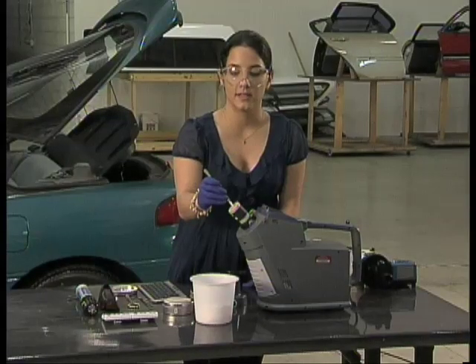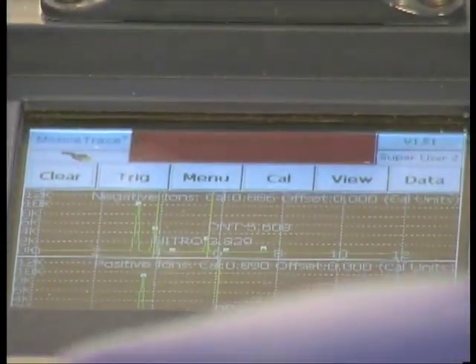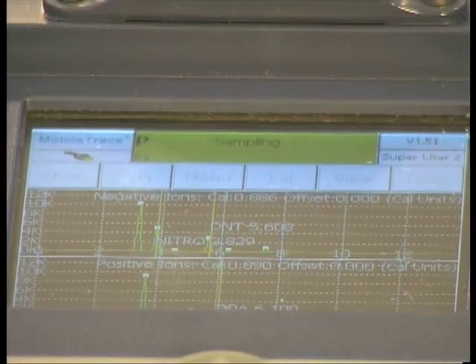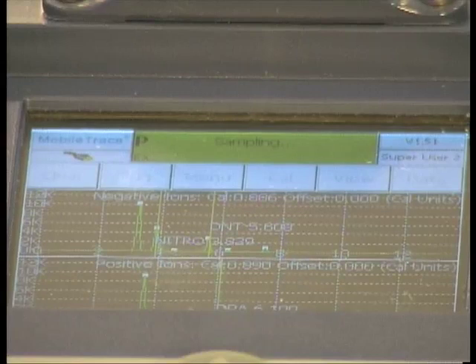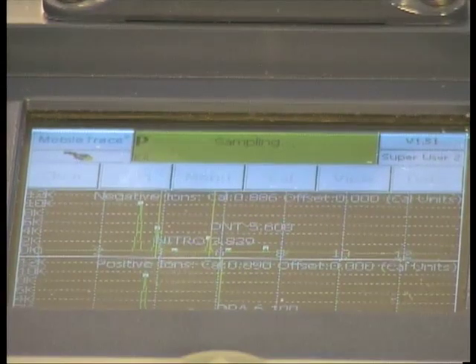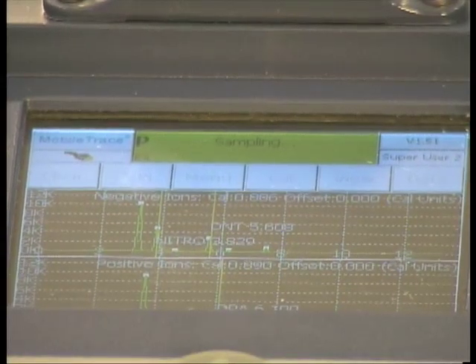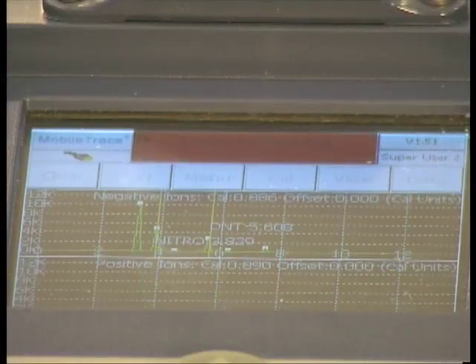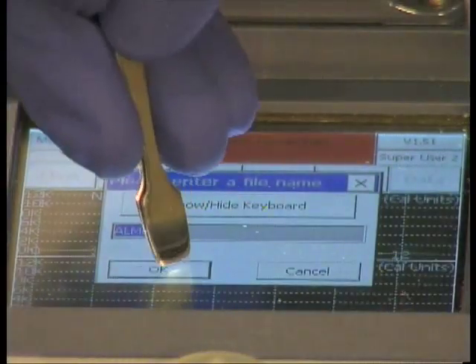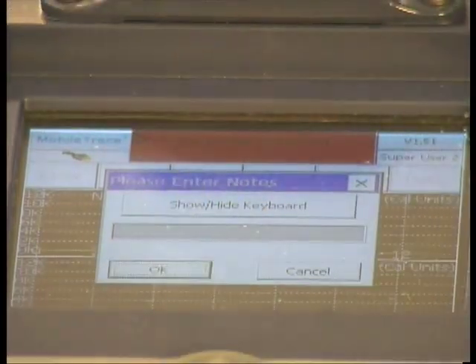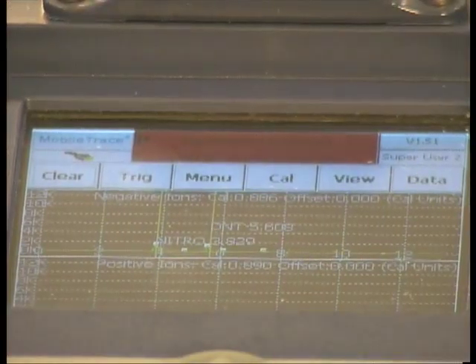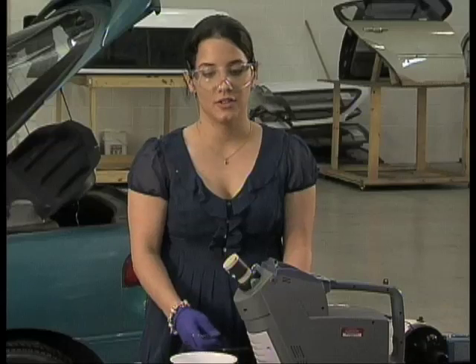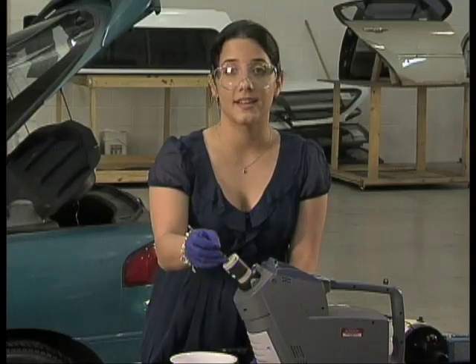We are going to desorb once more, because we absorbed so much of these vapors during the sampling time the PSPME was exposed to within that trunk. And again we still see DNT and nitro — two additional peaks on the second desorption.